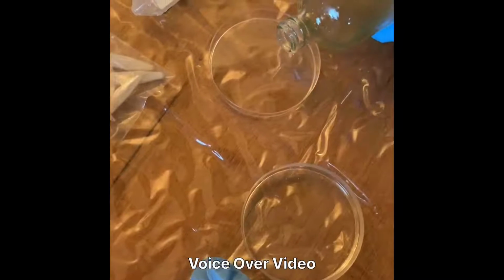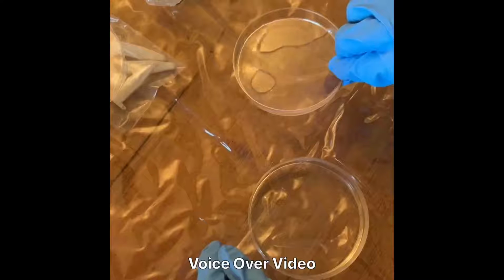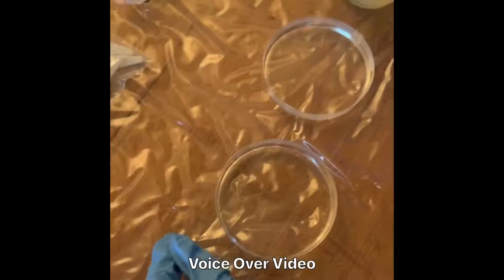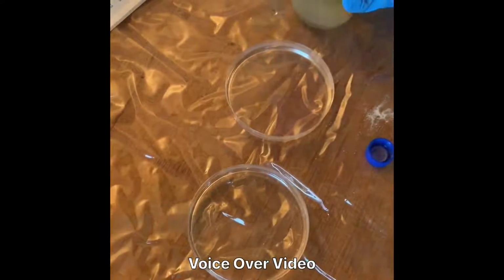So after that, I poured all of them. I poured the liquid in, and then I let all of them set. And then after they set, I came back and I took some of them.